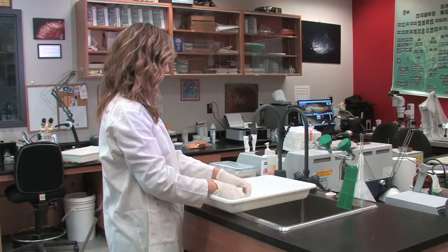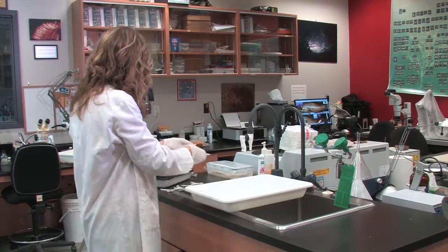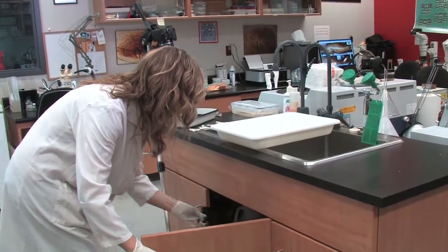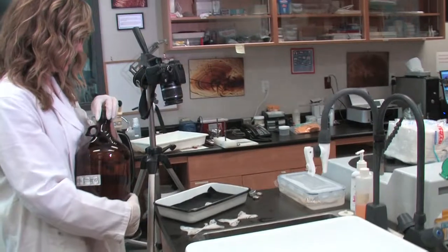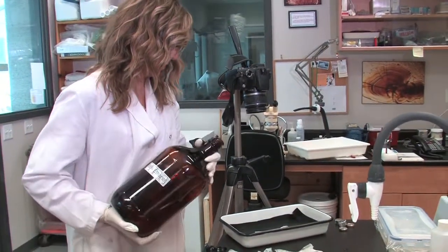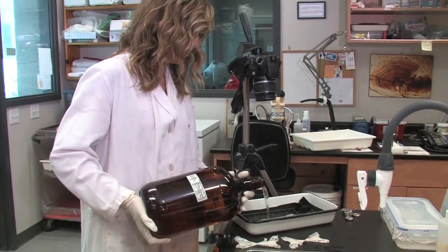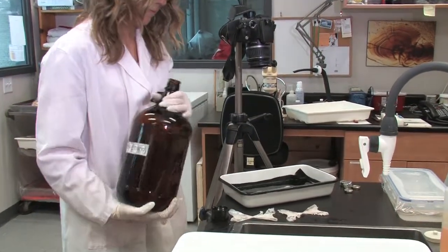Set up a digital SLR or single lens reflex camera of at least 8 megapixels or higher on a tripod or camera stand. The camera should be about 30 centimeters above a lab bench or table. Line a small pan with black felt or some other black fabric and place it directly below the camera. If using a tripod, this is best done on the corner of a lab bench or table. Place the vertebra section in the pan and add enough 95% ethanol to fully cover the section.